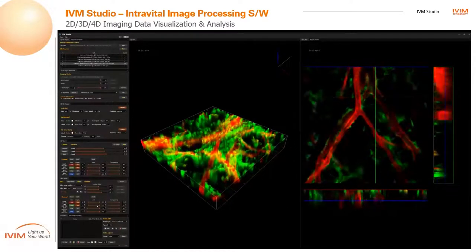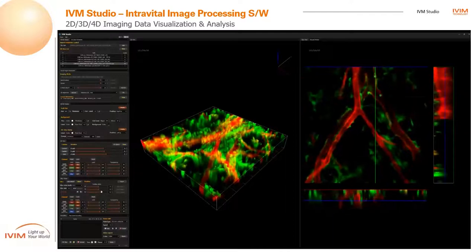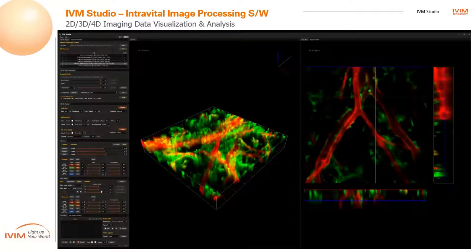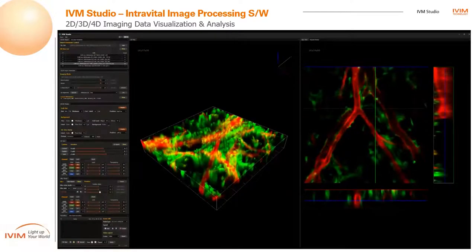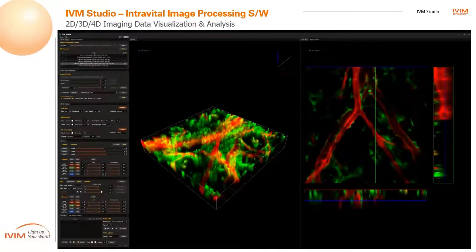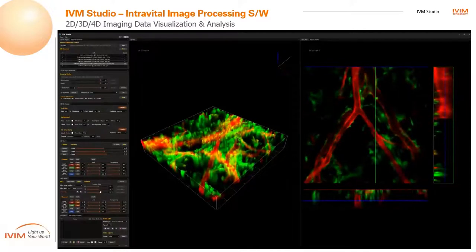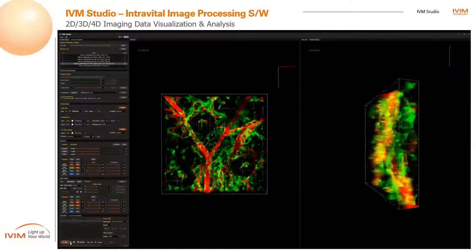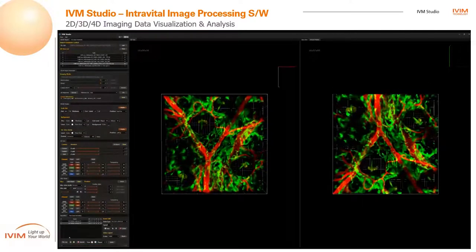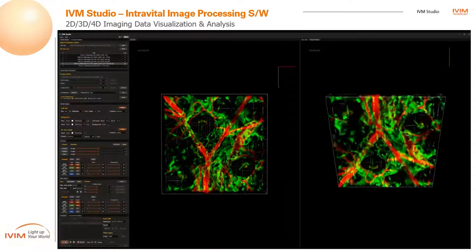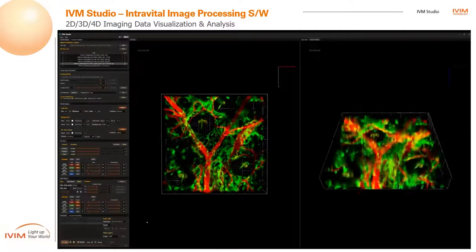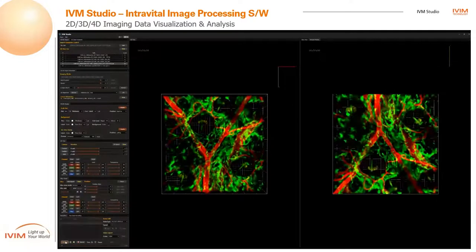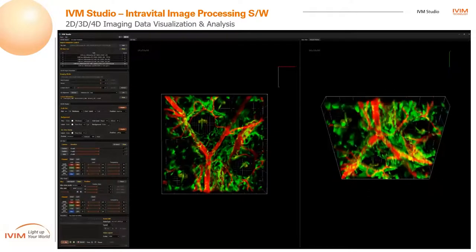With the measurement function, quantitative analysis of vessel dilation before and after drug treatment, immune cell trafficking, cell-to-cell distance, and cell-to-cell contacts can be performed in Studio software. In addition, 4D quantitative analysis of immune cell movements, cellular speed, direction, cell-to-cell distance, and the number of contacts over time can be performed in 4D in Studio software.